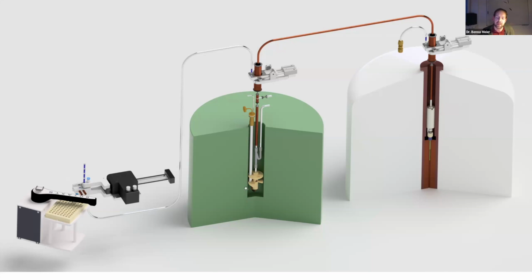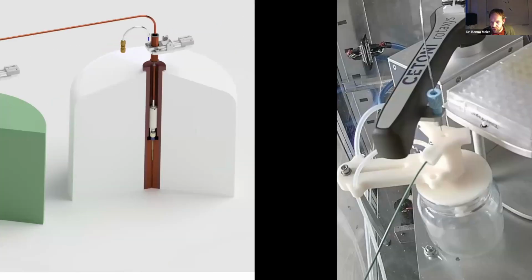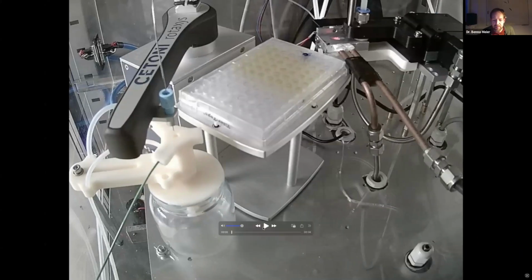And then once that is done, and this we've published already a while ago, we shoot it out into this injection device here where we dissolve it, and then we record the NMR spectrum. Okay, I'd like to show you this machine that prepares the bullet.